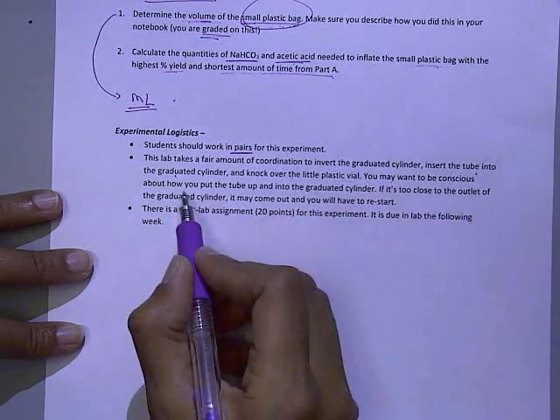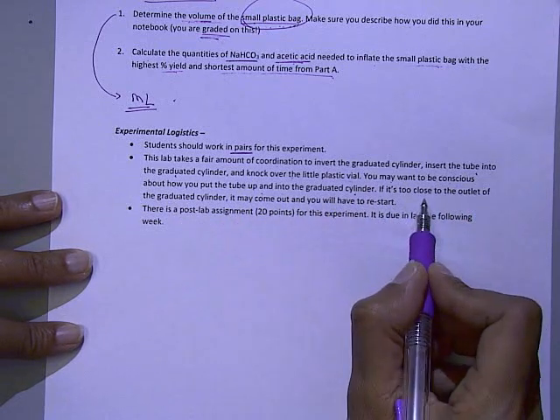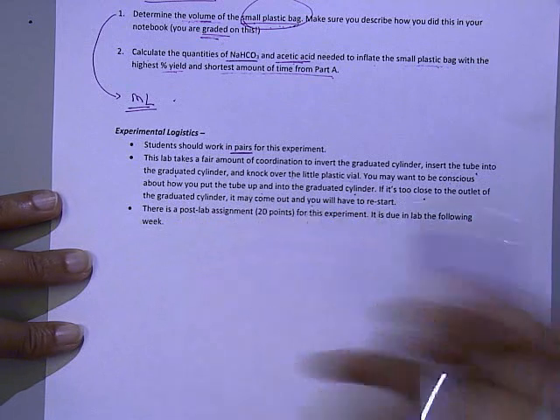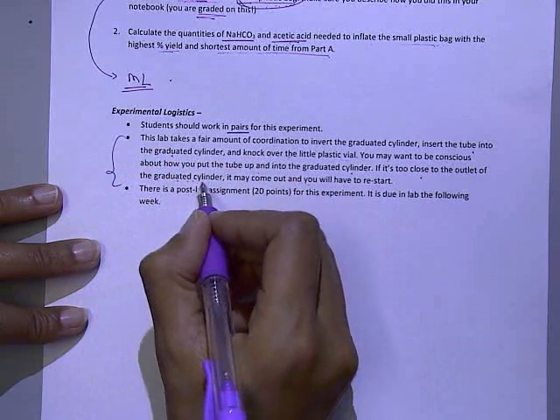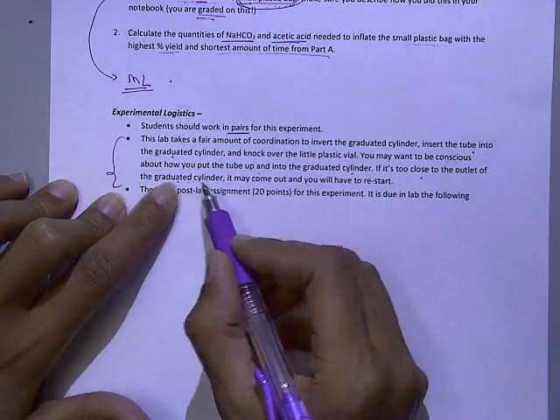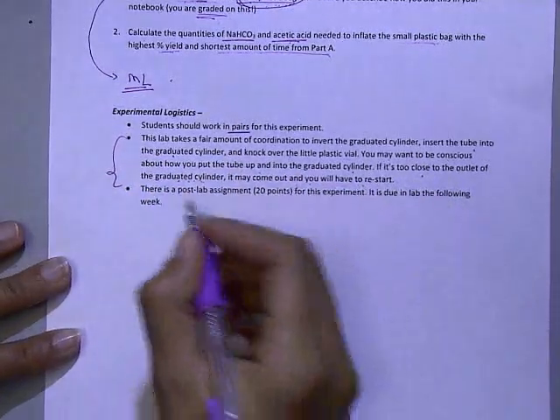Make sure you're conscious of how you put the tubing up and into the graduated cylinder. If it's too close to the outlet of the graduated cylinder, the tubing is going to actually come out and you're going to have to restart this. So actually from previous years, the thing that really takes the longest here is the tubing escaping the graduated cylinder, and you'll have to restart it, okay?